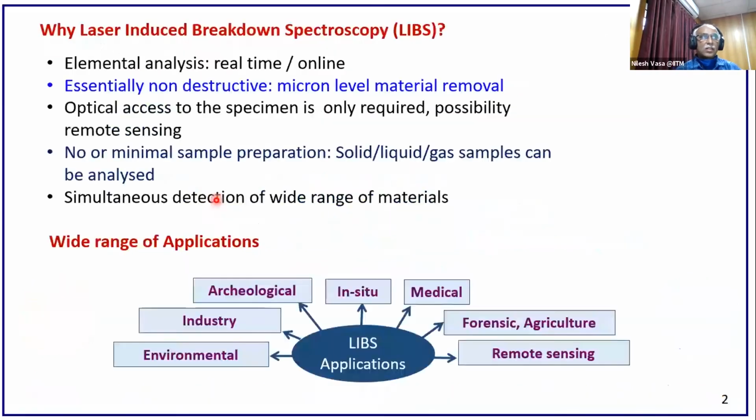We'll go to the next slide. First, what is laser-induced breakdown spectroscopy, LIBS, and why are we considering LIBS? Laser-induced breakdown spectroscopy applications as such.